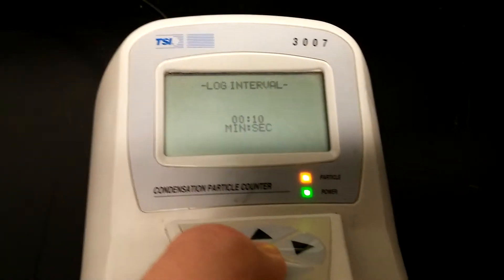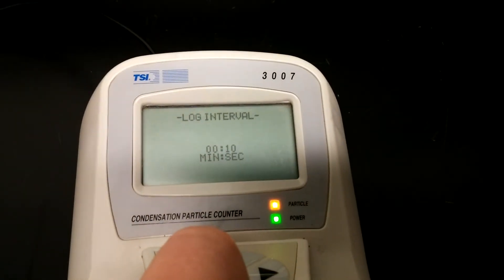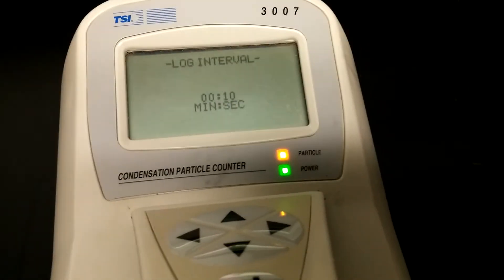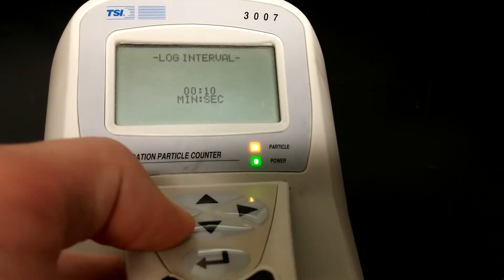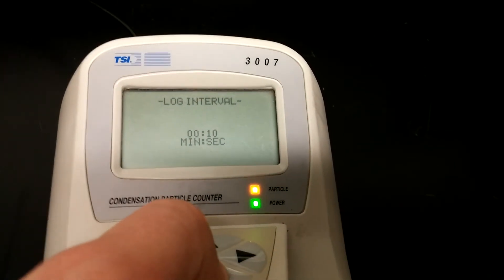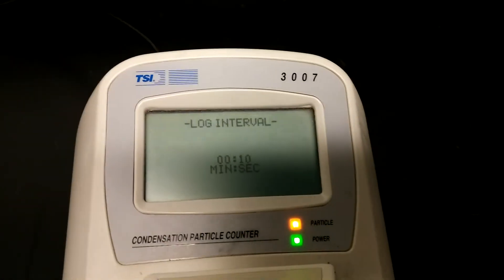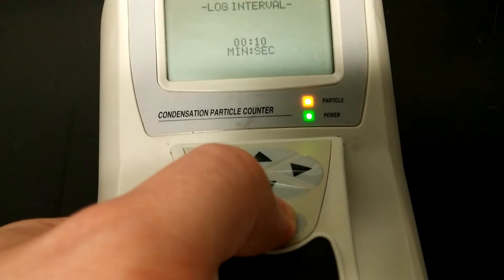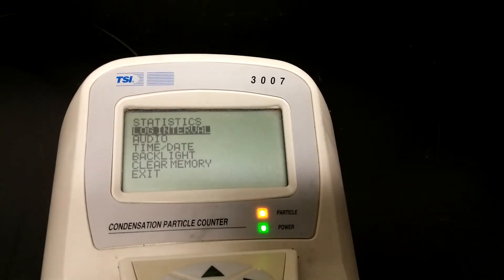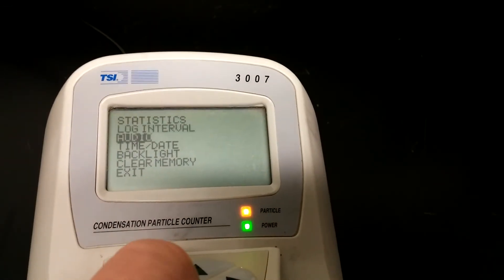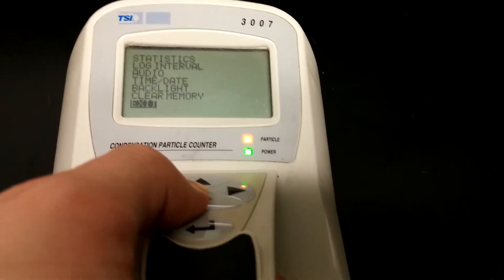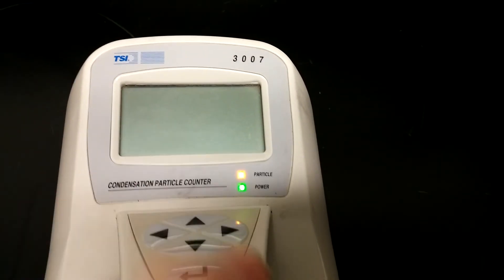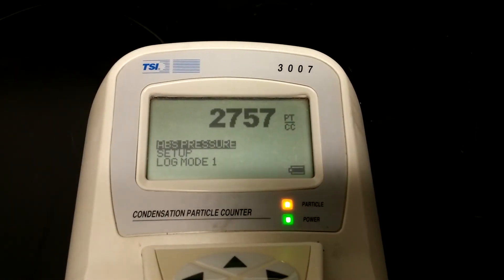If it's not set on 10 seconds, keep pressing down to cycle through all the options until you find 10 seconds. On this CPC, all the options happen to be 10 seconds. Once you find the one with 10 seconds, press the enter button. Then go down until you select 'Exit' with the down arrow and press enter. Now you're back to the main screen and your logging interval has been set to 10 seconds.